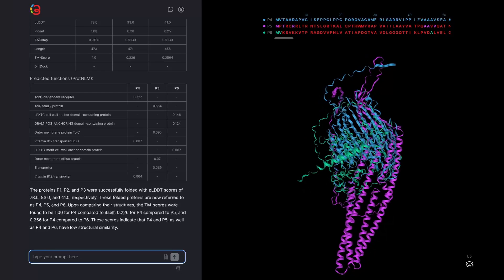To make comparison of ProtNLM results across sequences easier, we bring in the top 10 functions across all the compared sequences. In just 8 words, we were able to run over 10 functions in less than one minute.